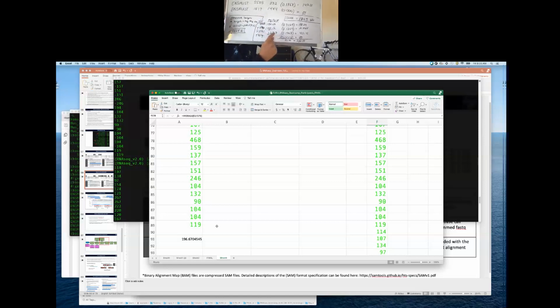And then what I did again is I took those proportions based on the isoform percentage that are expressed in our samples and multiplied it by this average length to get these numbers. And of course, that last transcript in the list isn't expressed. And then again, I summed that up to give me the average fragment length size that's weighted based on the expression of each transcript. And I just put that number here too, so we could keep track of it.